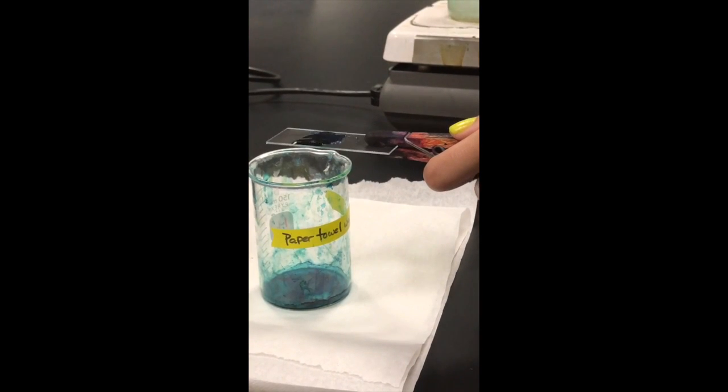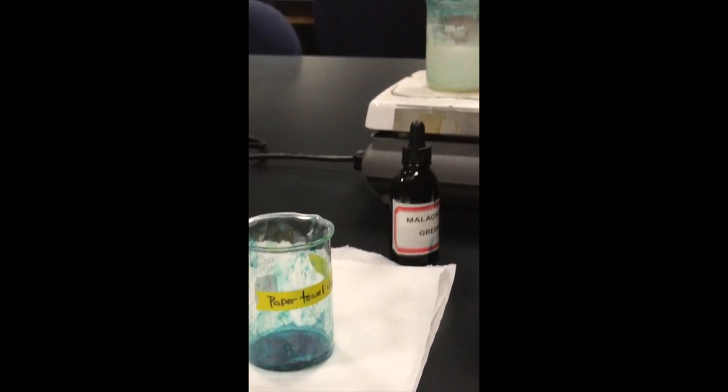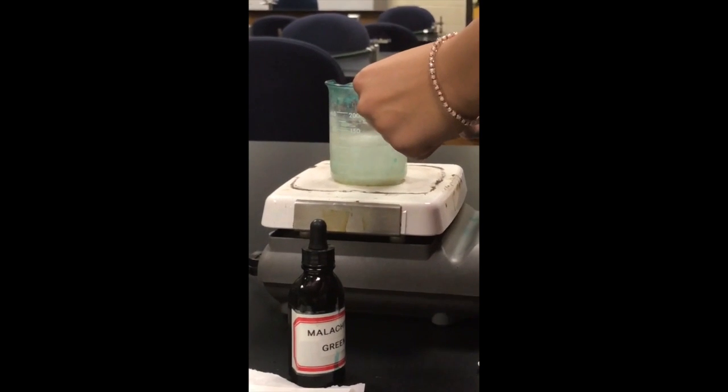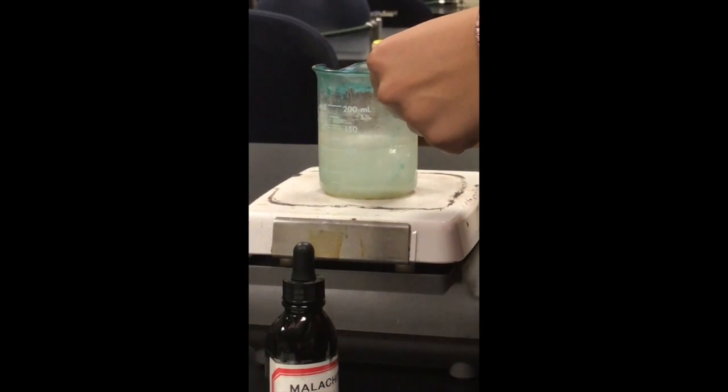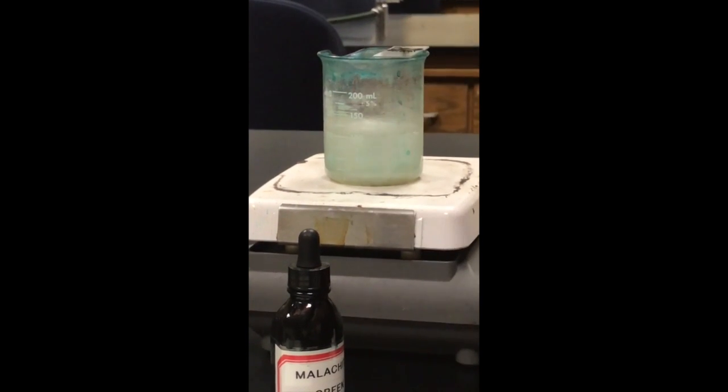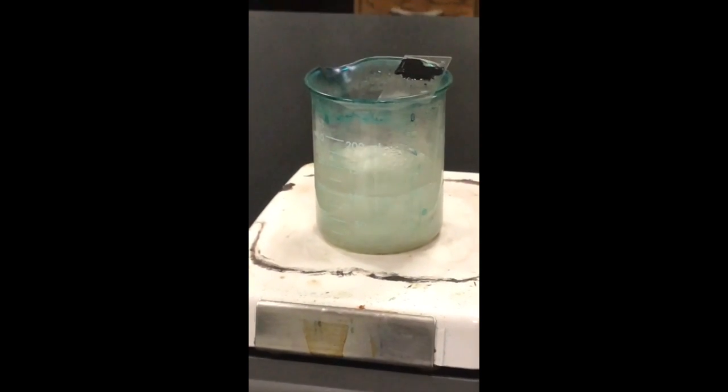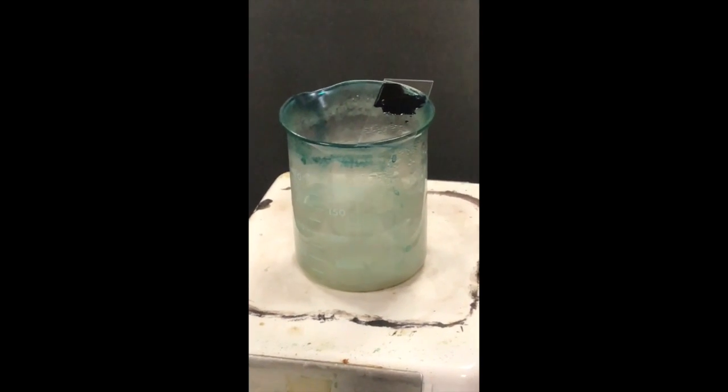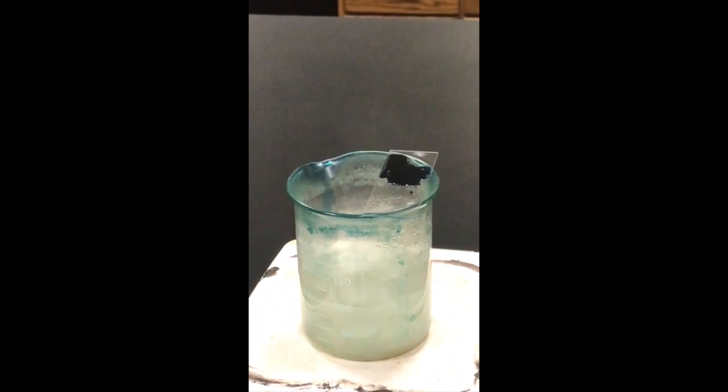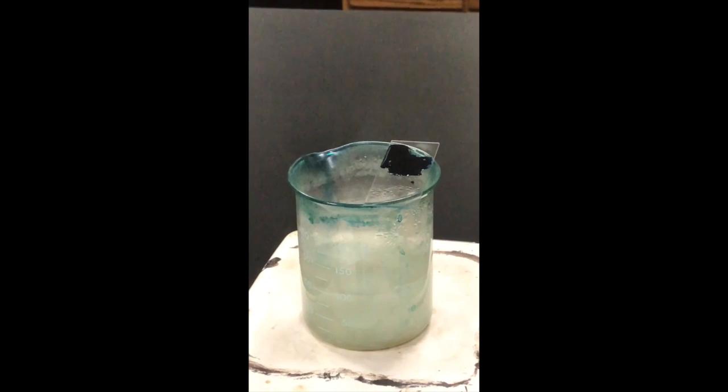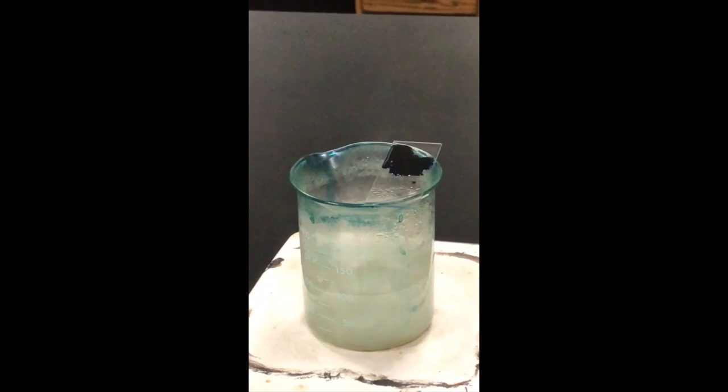Now that it's been flooded, you're going to rest it on the beaker that you've allowed to boil. You want to steam the slide for about 5 minutes. Steaming the slide means that the dye itself is hot enough to generate steam. If the dye starts to dry, you want to make sure to add more malachite green and do not let the slide dry out.